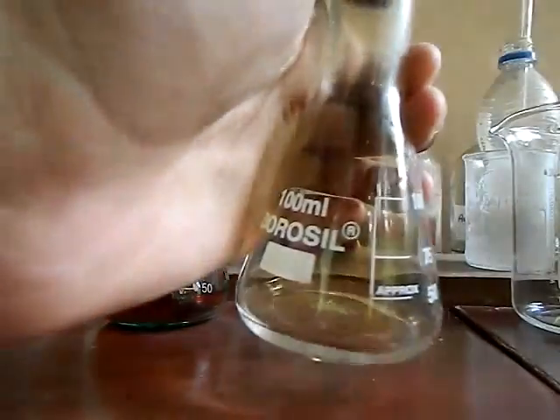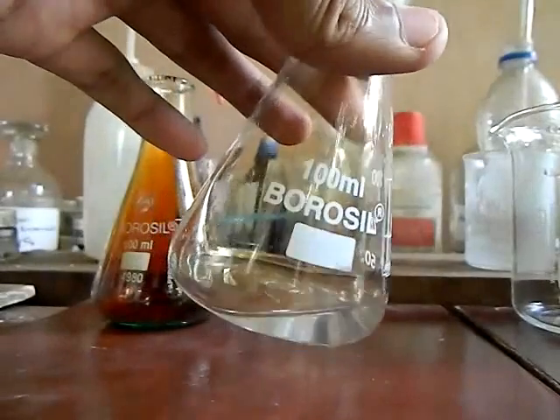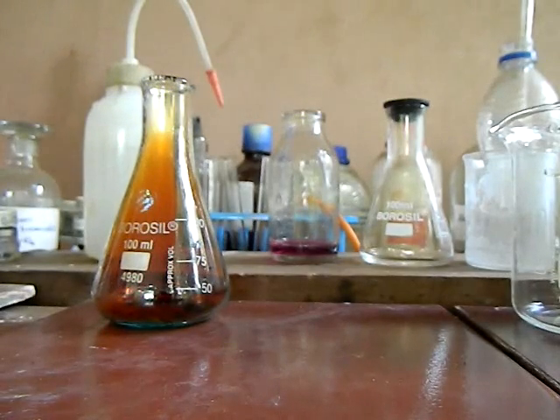Then we swirl the conical flask containing the potassium permanganate solution. You can see the color disappears — that is, it gets decolorized. Here the nitrogen dioxide reduces the permanganate ion and decolorizes the potassium permanganate, as it is an oxidizing agent, hence the color is decolorized.